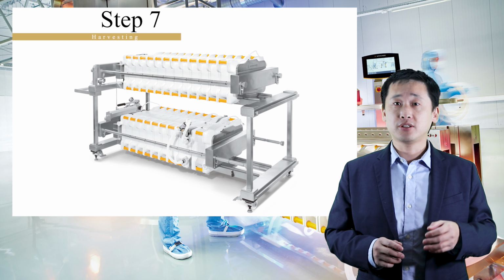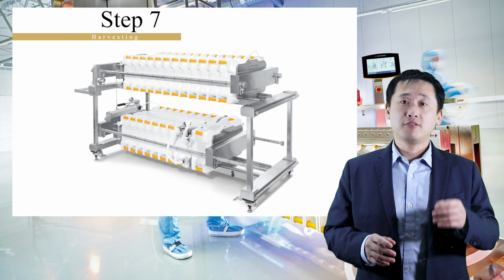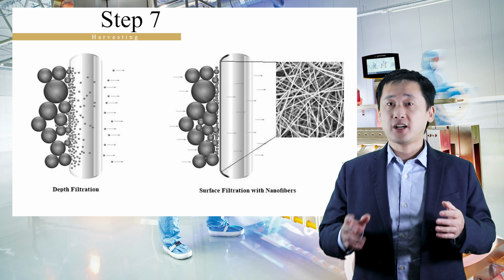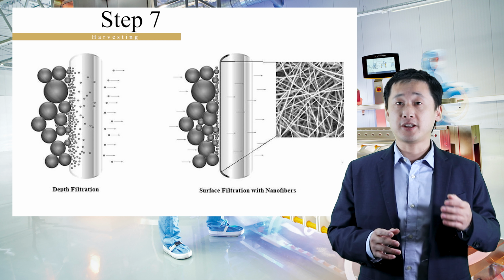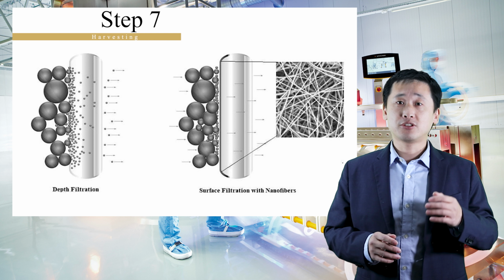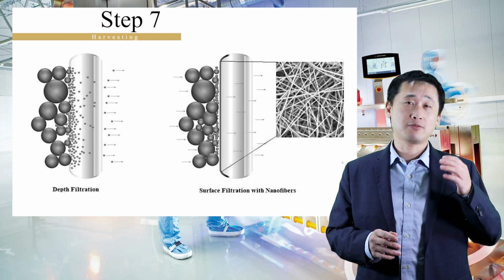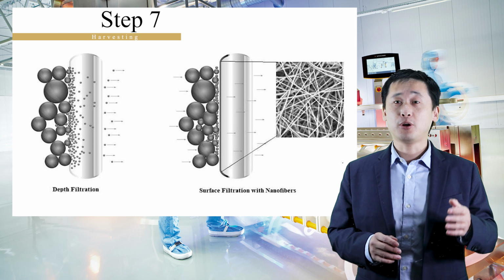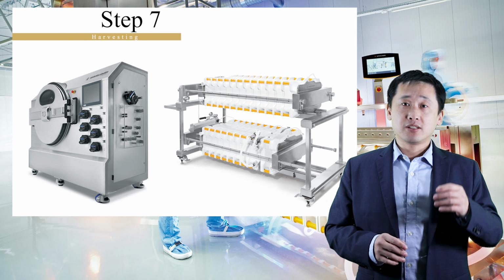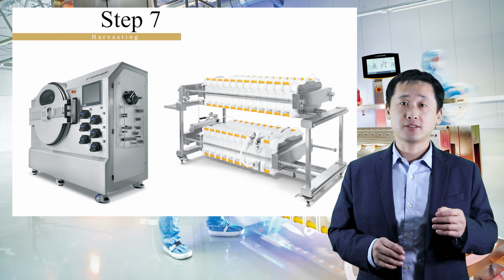After centrifugation, depth filtration is employed to further clarify the cell culture broth from insoluble impurities. Depth filters rely on both size exclusion and various adsorptive binding methods to improve separation. The filtration process is generally scaled linearly from 10 microns to submicron size, to around 0.2 microns or smaller in most cases. Both Sartorius Ksep and Sartoclear depth filters can achieve primary recovery processes.